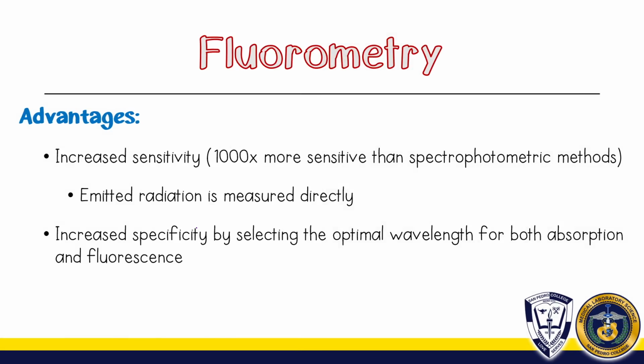And in addition, fluorescence actually measures the amount of light intensity present over a zero background. So, it is also very important to remember, as far as I could recall, that when we say zero background, there are fewer interferences that happen.